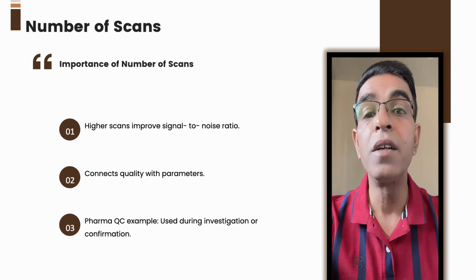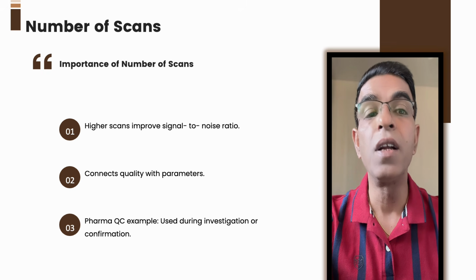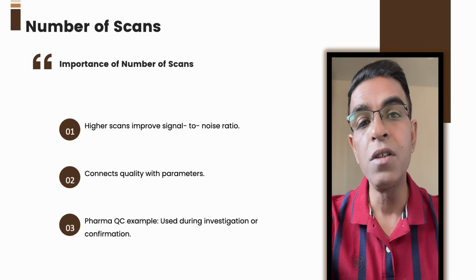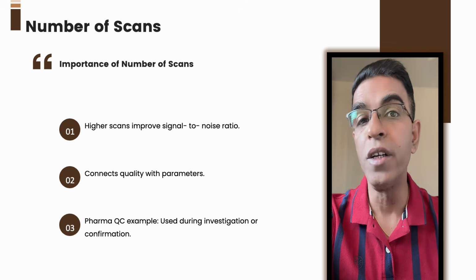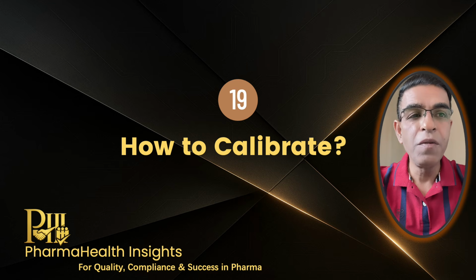Then add the practical balance. However, taking more scans also increases the total analytical time. So in routine QC work, the scan number is always optimized and fixed as per the standard operating procedure, depending on the requirement. This answer shows both technical understanding as well as the GMP discipline from your end. So you are doing a good job till now and the interviewer is very happy with you.